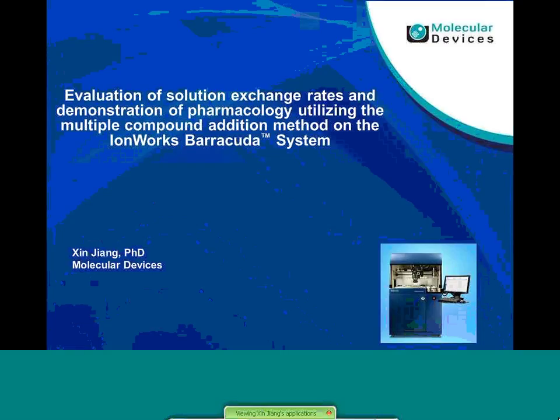It's a pleasure to have this opportunity to share with you some of the recent work we did on the IonWorks Barracuda system, with a focus this time on characterizing the fluidic parameters, solution exchange, and how the users could take advantage of these features to fully utilize the capacity of the Barracuda system for applications such as adding multiple compounds into the same recording site, the patch plate well, to further increase the throughput and to reduce the running cost.